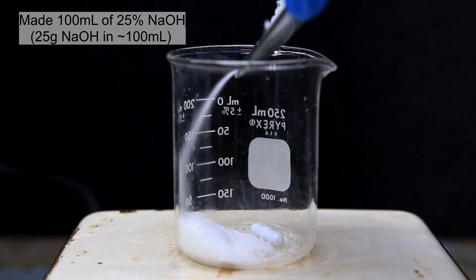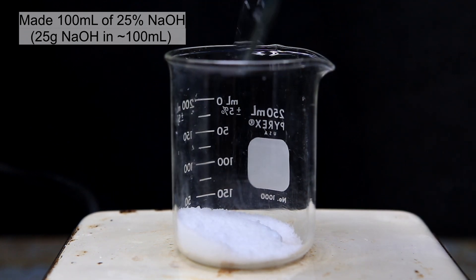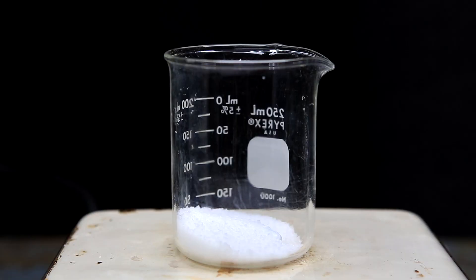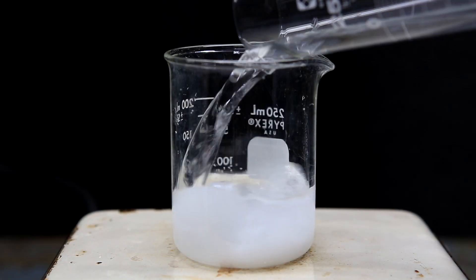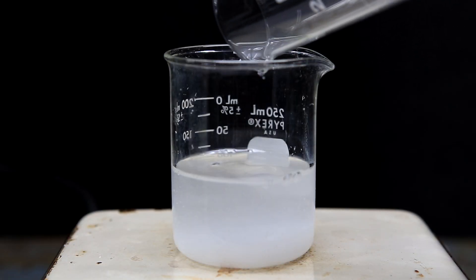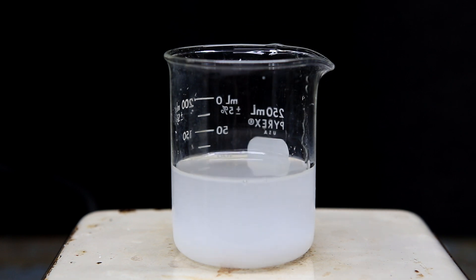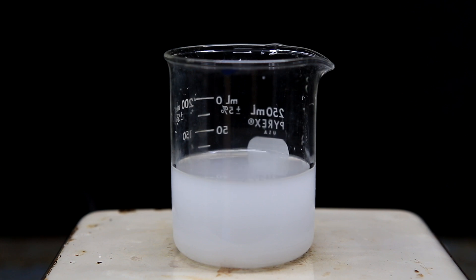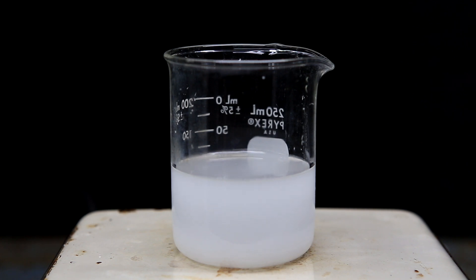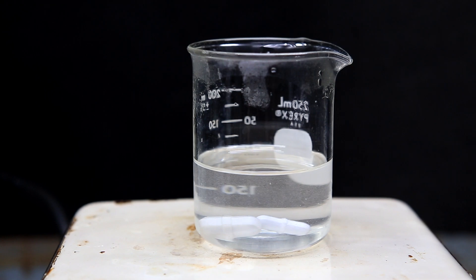The first thing I do is prepare a 25% sodium hydroxide solution. To do this, it's pretty simple and I simply add 25 grams of sodium hydroxide to a beaker and then top it off to 100 milliliters. 100 milliliters of this solution is pretty overkill and in reality we only really need 10 milliliters. The sodium hydroxide will react with our hydrochloride salt and liberate the freebase.